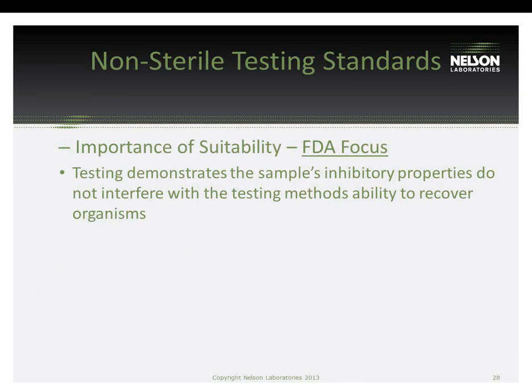With the testing, it's very important to have a suitability performed. A suitability demonstrates that the test actually is valid and shows that if there are any inhibitory properties of the sample, organisms can still be recovered during the test.